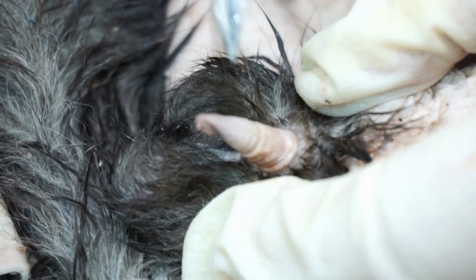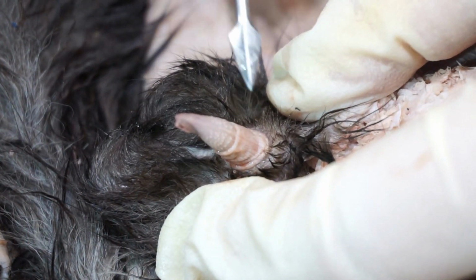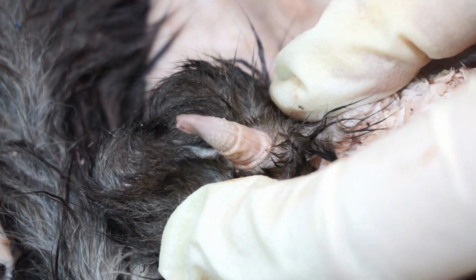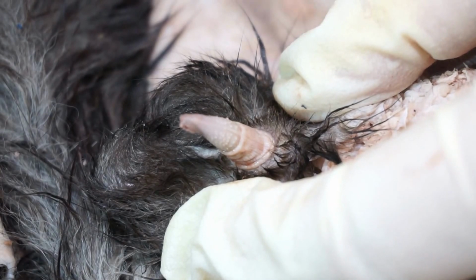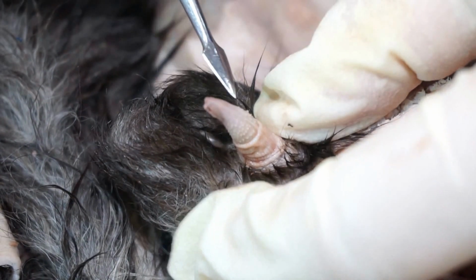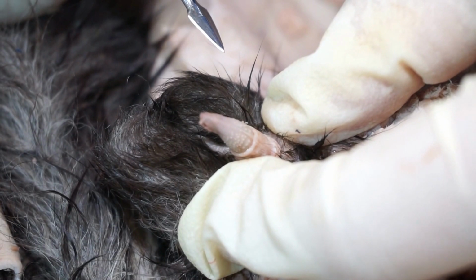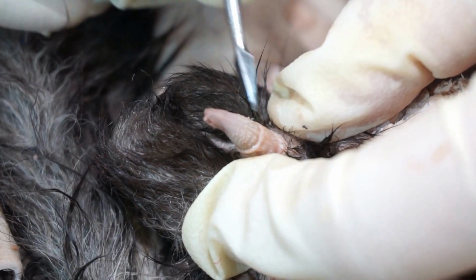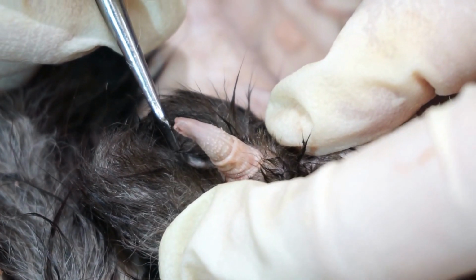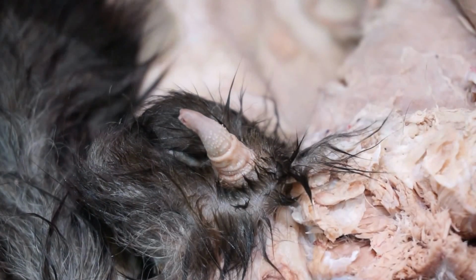The glans is the free part of the cat's penis, and that is, if you could zoom in, those would be those keratinized spines on the glans portion of the tip of the cat's penis. And this would only be in an intact male. Cats also do not have a bulbus glandis. We just refer to the distal end as the glans portion. They do have an os penis. It is just very small and indistinguishable.